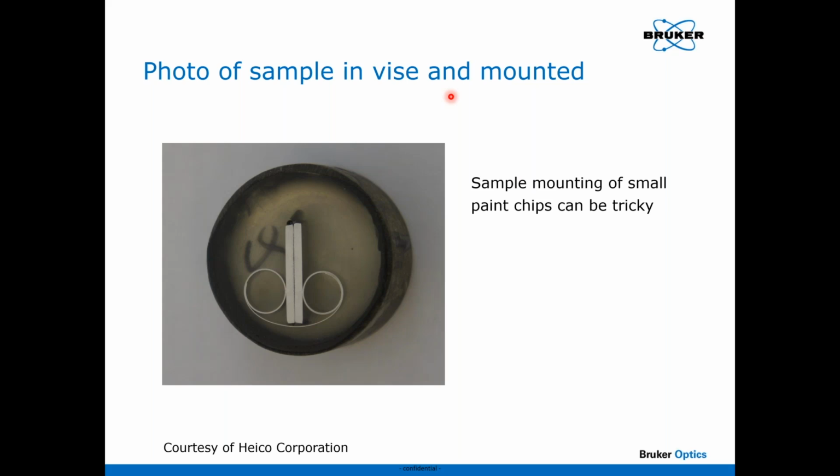The benefit to doing it this way, rather than dropping the polymer or whatever multi-layer sample directly into the methacrylate, is that many samples are porous, and so the methacrylate would bleed into the sample and complicate the analysis. So I really like using these clips to do the mounting of my samples. And for most samples, these clips would just sit on the microscope stage anyway, and you don't even need to put them in a methacrylate unless you're archiving them like I usually do.